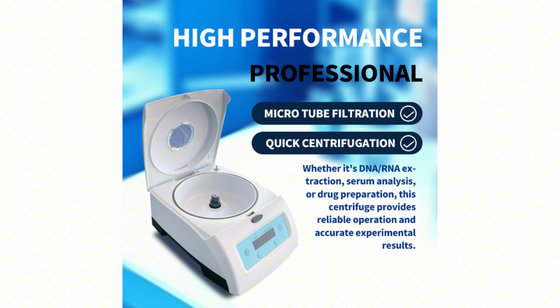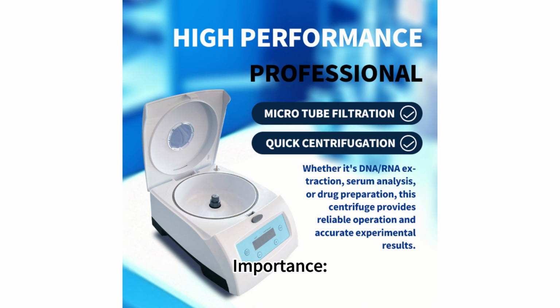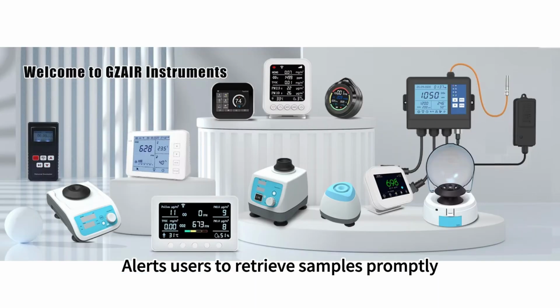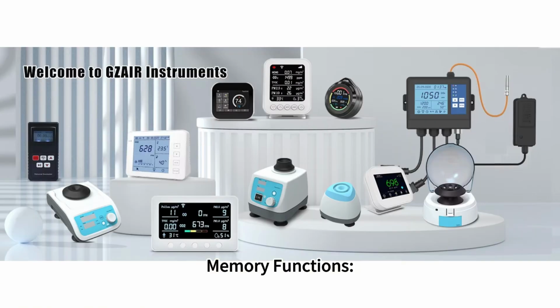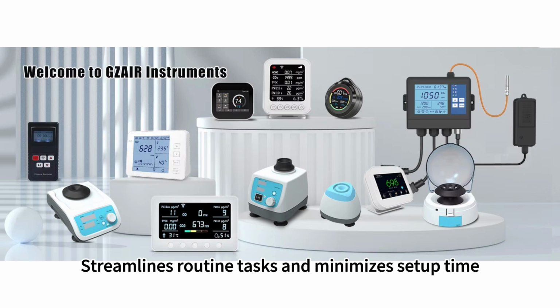Alarm system feature. It sounds an alarm when the cycle is complete. Importance: it alerts users to retrieve samples promptly. Memory functions feature. It saves previous settings for quick recall. Importance: it streamlines routine tasks and minimizes setup time.